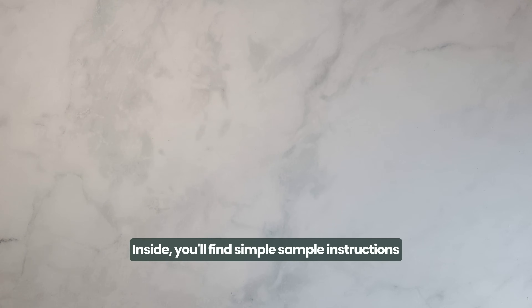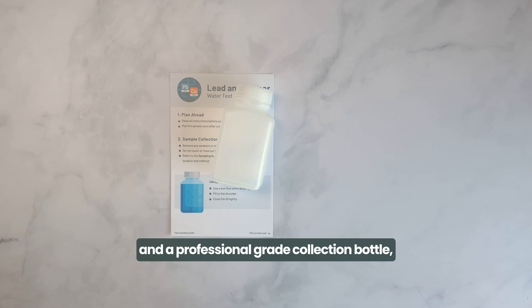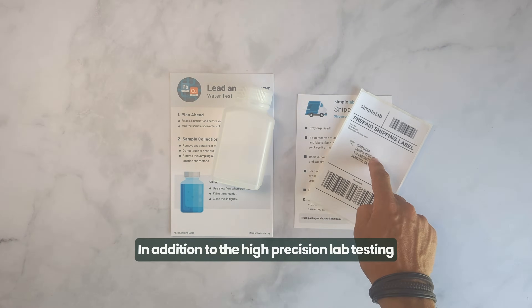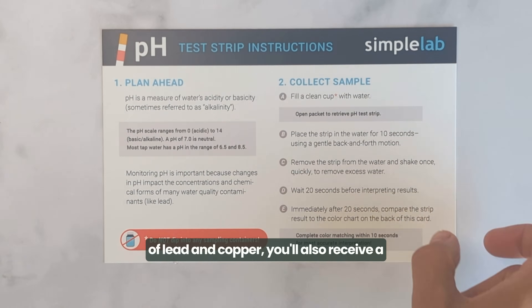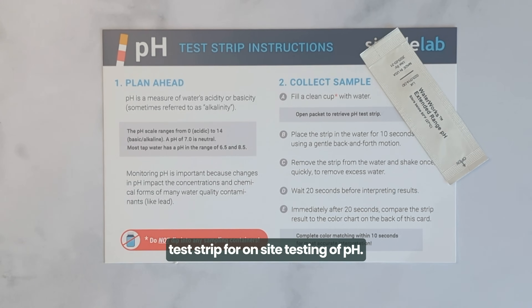Inside, you'll find simple sample instructions and a professional-grade collection bottle, plus free return shipping. In addition to the high-precision lab testing of lead and copper, you'll also receive a test strip for on-site testing of pH.